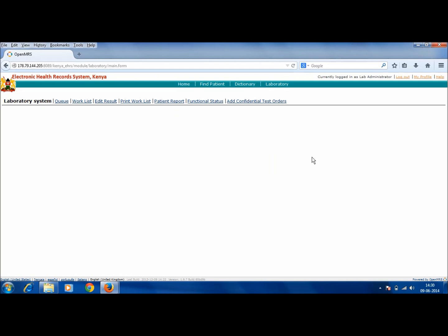The following screen will begin to appear. This is the interface of the laboratory system. We will be using Queue, Worklist, Edit Result, Print Worklist, and Patient Report.